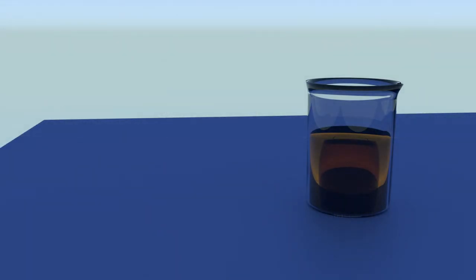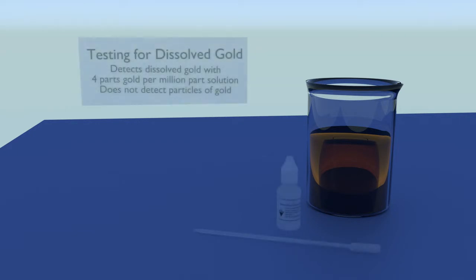Before pouring off the waste solution, you will want to make absolutely sure that 100 percent of your dissolved gold is precipitated out of solution. For this test you need precious metal detection liquid. You can buy this ready-made or you can put it together yourself. Basically it's concentrated HCl infused and saturated with stannous chloride and very pure tin.